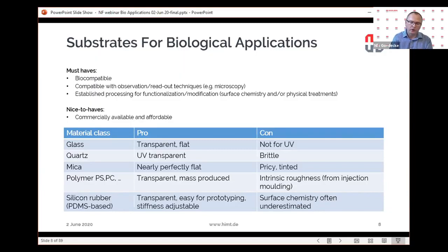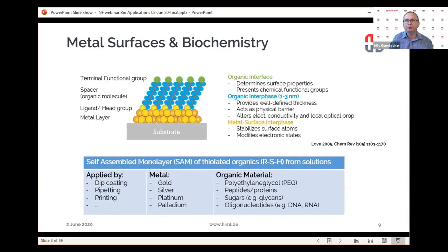There are also methacrylate hydrogels, but this would not work. So people ask what materials can you use with the NanoFrazor? I keep on saying, if it is flat and we can spin coat it, bring it on. We can basically work it out. And that gives us quite a bit of opportunities.